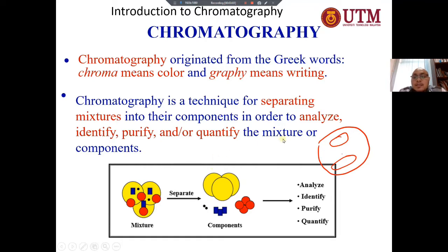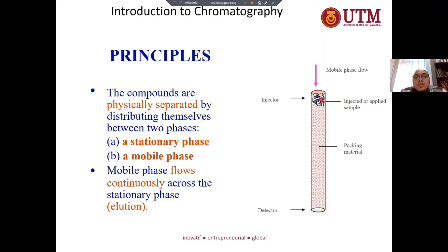Okay, so here is the definition of chromatography. I believe this kind of question of definition is one of the most popular ones. So we have learned about the definition of chromatography. Next, we will look into the principle of chromatography, how chromatography works.